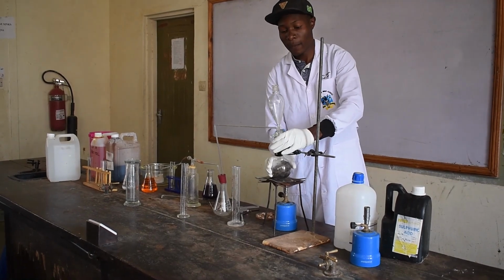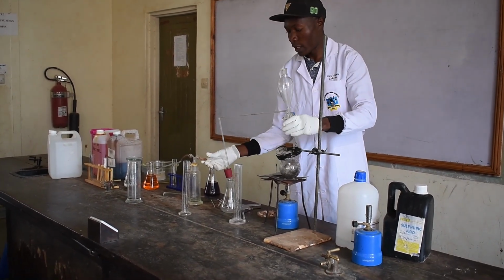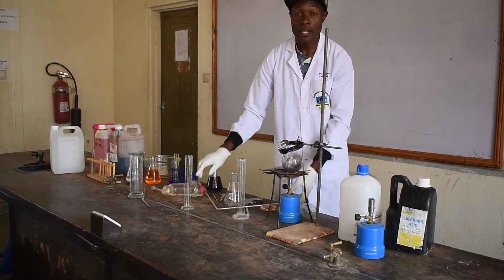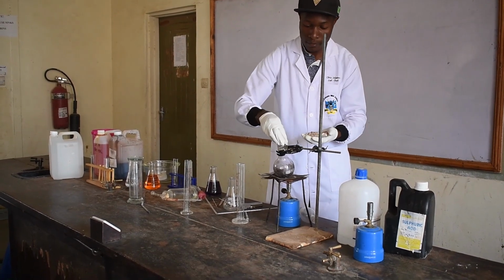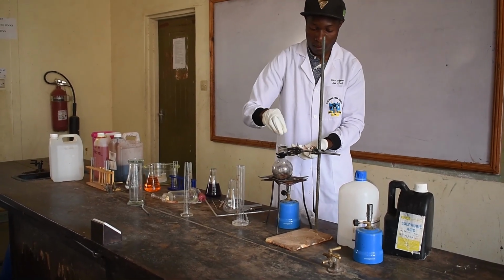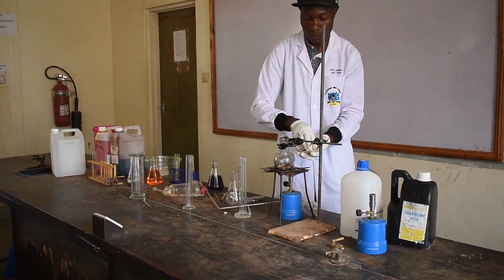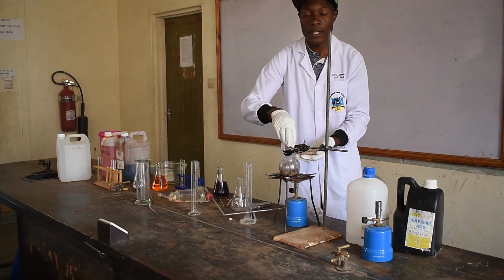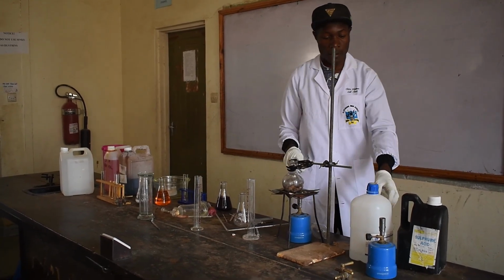In the round bottom flask, we are going to insert porcelain beads. These are our porcelain beads. The porcelain beads will majorly prevent the bumping of the liquid, that is, the mixture of sulfuric acid and ethanol.